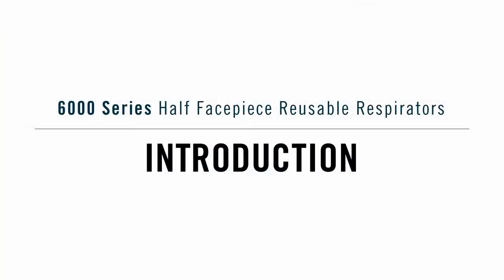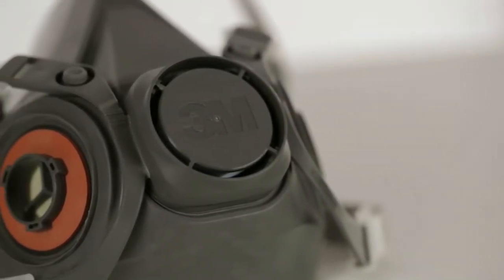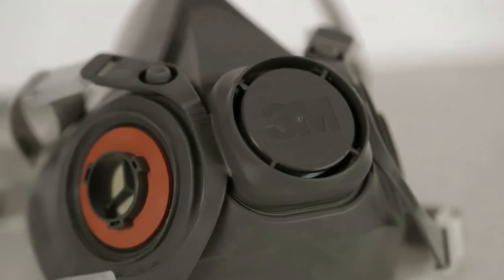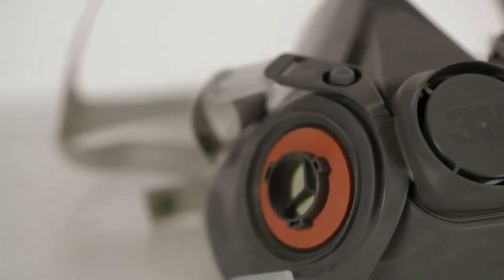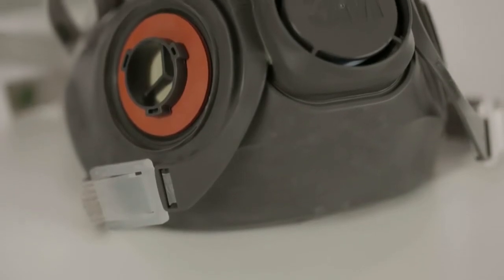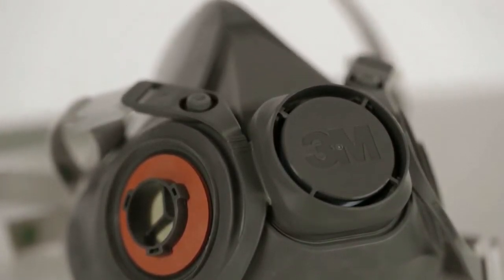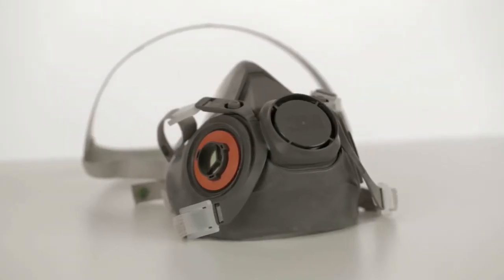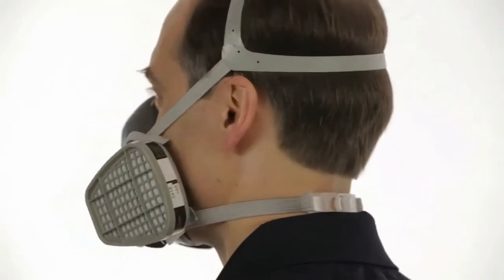Introduction. In many workplaces, the air you breathe can be hazardous, potentially harmful dusts, mists, fumes, gases, and vapors. Breathing airborne contaminants can damage your lungs or cause other sickness or disease, even death. If engineering controls or other measures are not sufficient, you can help reduce your exposure to certain airborne contaminants by wearing a respirator. Each time you wear a respirator, you must know the proper fitting procedures and follow them carefully.